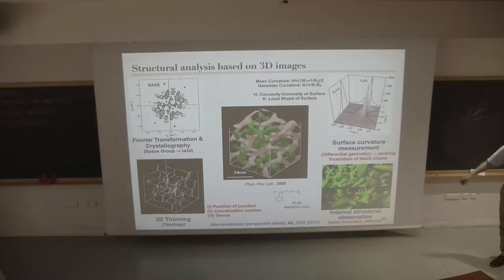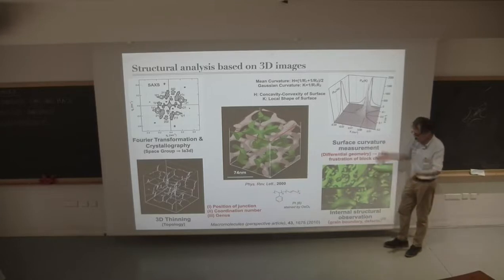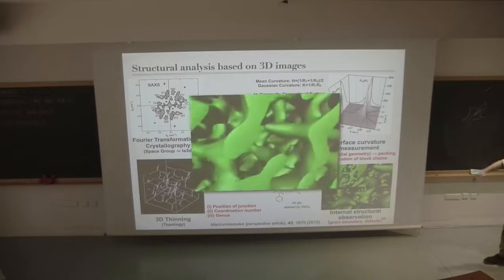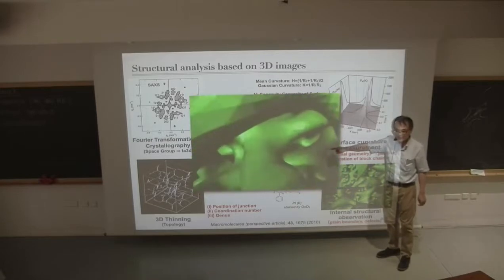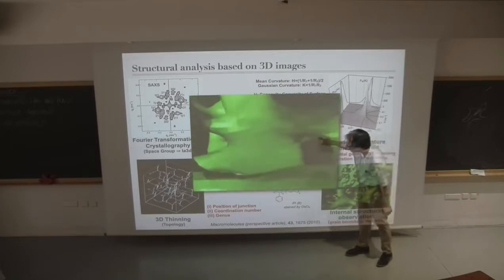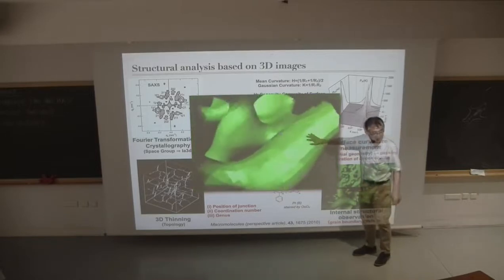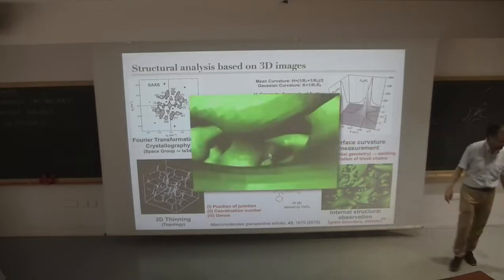And of course, from this kind of data, we can make a three-dimensional image, and then we can go into the sample and look for a defect, for example, like this. This is 15 years ago data, with a very inferior type of machine compared to today's machine. So these polygons are rather big. Otherwise, we cannot move the data, but actually the data is more precise. Looking at this data, it's interesting in many ways.